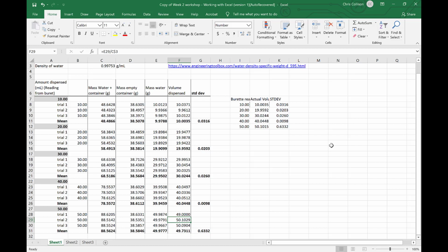I'm going to then go back, by the way, and use the Control Z function to undo the change that I made, since that was an arbitrary change just used for the purpose of demonstration. So now I'm going to make these column headings bold.